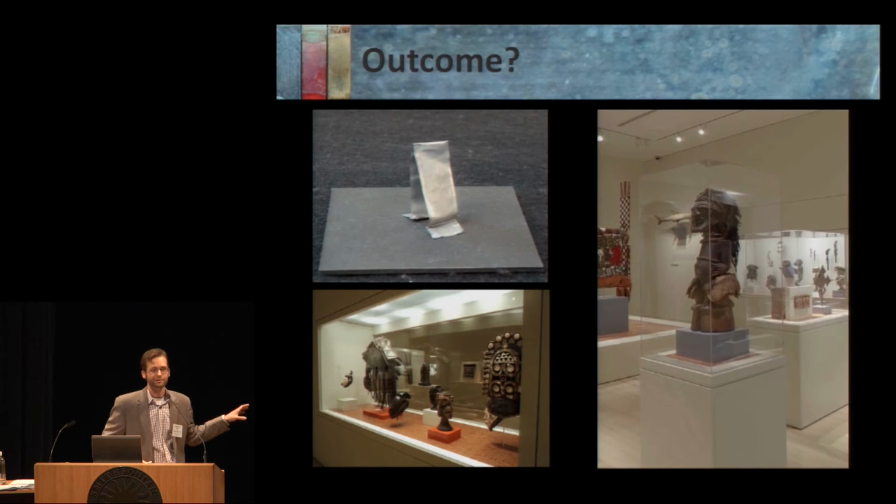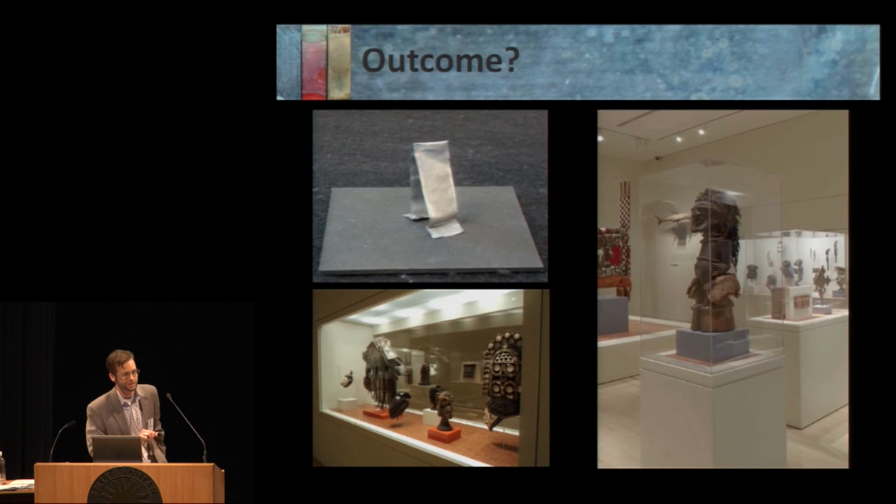Well, it's been 3 years since we opened these spaces, so it's fair to ask, how are we doing? This is an example of one of those lead dosimeters. It doesn't photograph very well, but a little bit of the polish is being lost along the borders, but we're certainly not seeing the sort of powdery white corrosion that is evidenced in the Oddy test.